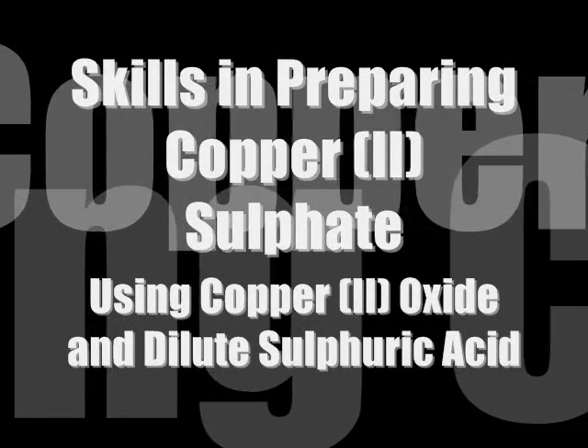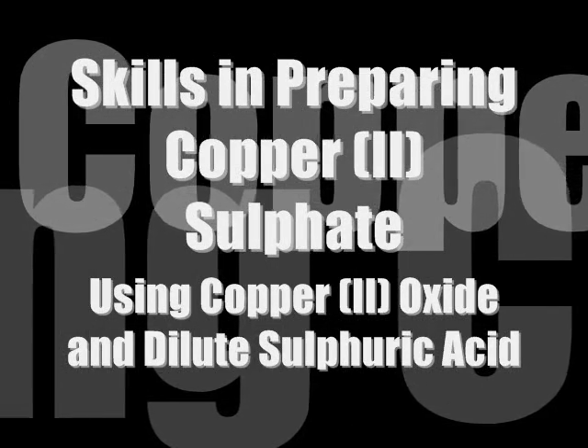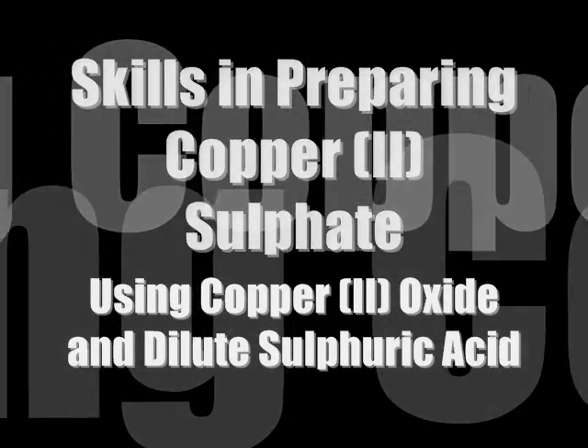In this video, we will learn the skills in preparing copper(II) sulfate using copper(II) oxide and sulfuric acid, including skills on preparing a saturated solution.